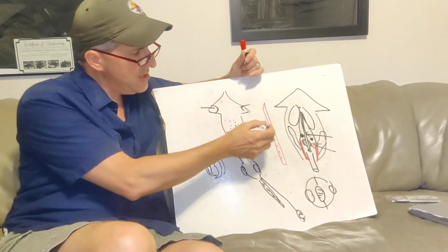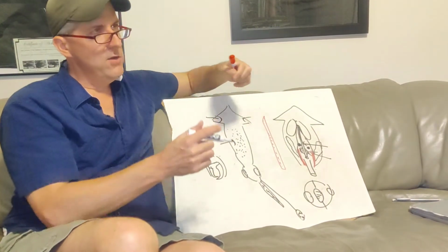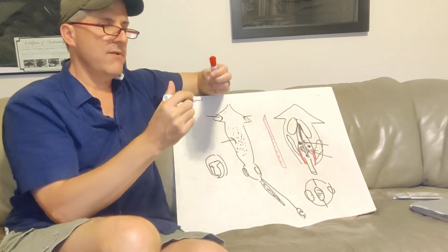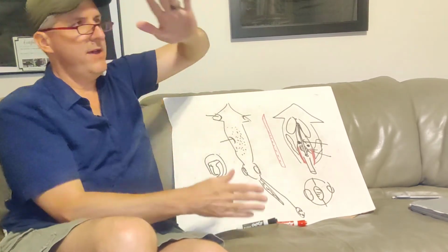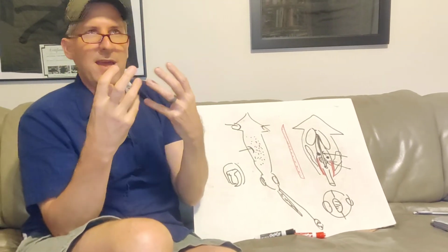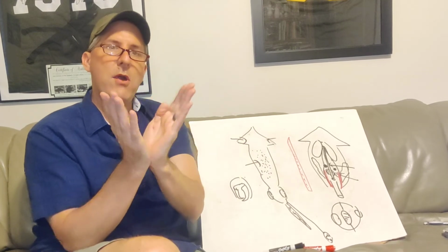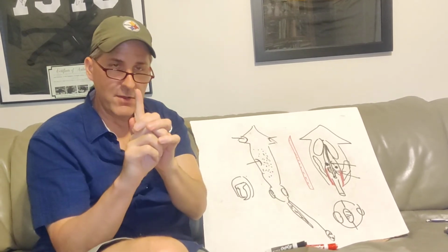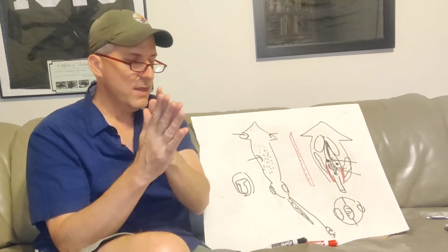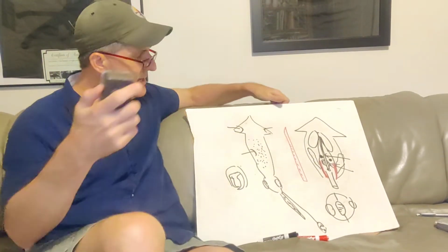It's made of the same material, the chitin, that makes up the pen. Now, what you would then do is take the two beaks out, and it almost looks like a flower. Think of a rosebud with three petals. These are three muscular, what are called labial palps. Labial meaning lip, but not really. Basically, just three muscular flaps. You can pull them apart, and this little tiny thing pops up in the middle. And lo and behold, if you rub your finger over it, it feels like sandpaper. That's the radula.